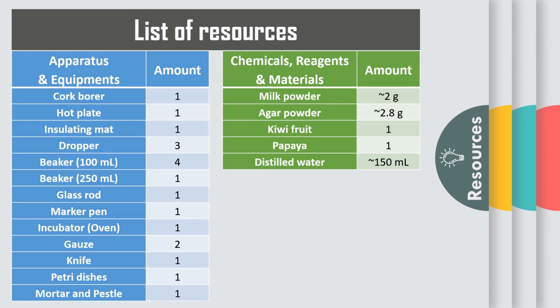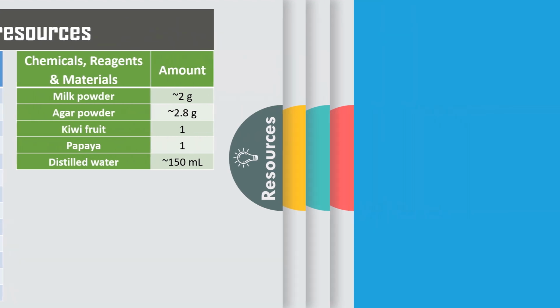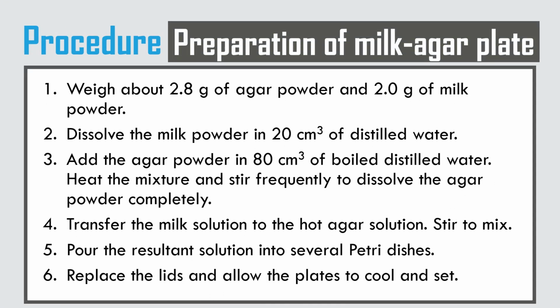And here is the list of the resources. Let's go to the procedure. And this is the procedure of preparation of the milk agar plate. And we'll show you in the video.